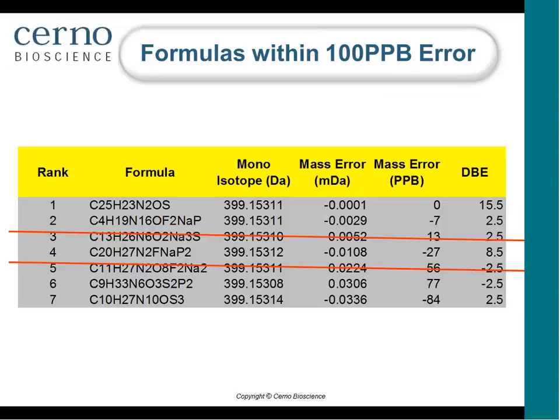As you know, however, this is not unheard of. For example, the sodium TFA would contain multiple sodiums, yet it would be singly charged. But by taking a little bit of a risk and using chemistry knowledge, you might be able to narrow it down to the top 5 candidates to look at and to investigate.